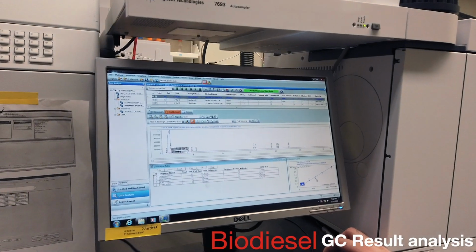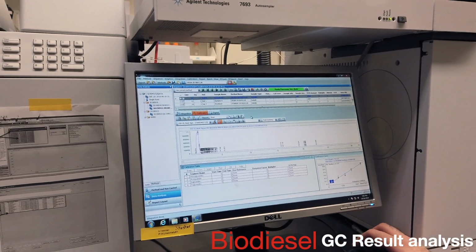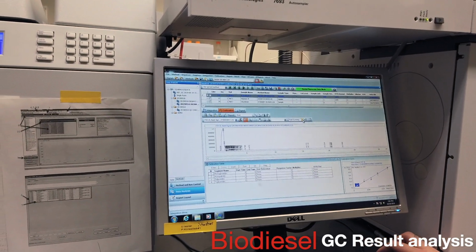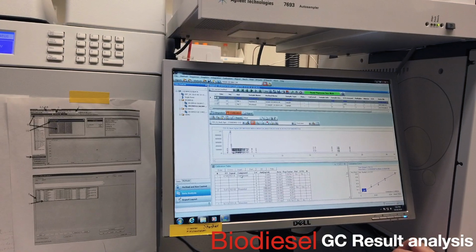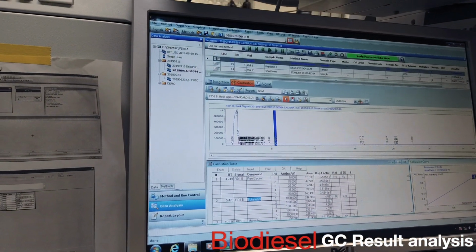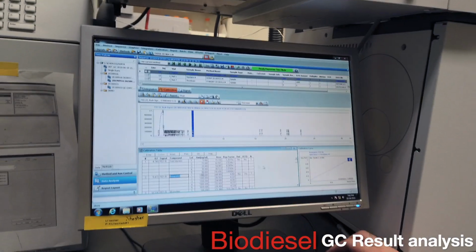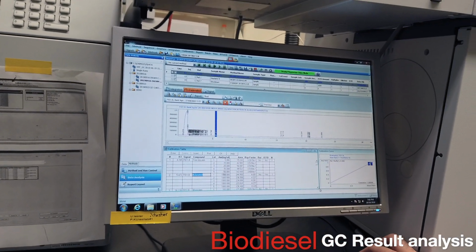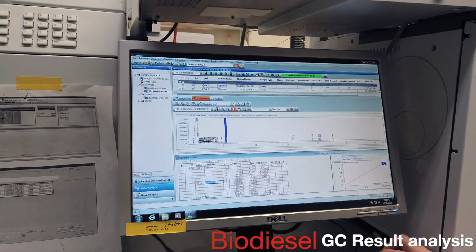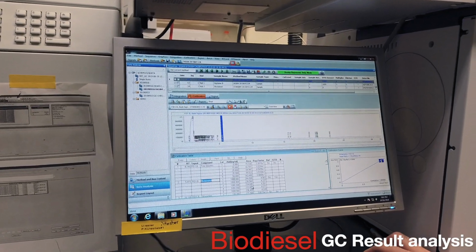So this is the result. No, this is the curve for what we did. Yeah, this is the curve for glycerin. If you go to overview, this is glycerin, this is butane triol, and these are supposed to be sitting on top of each other because they're supposed to be the same. It's pretty tight, like plus or minus 10, maybe 12.